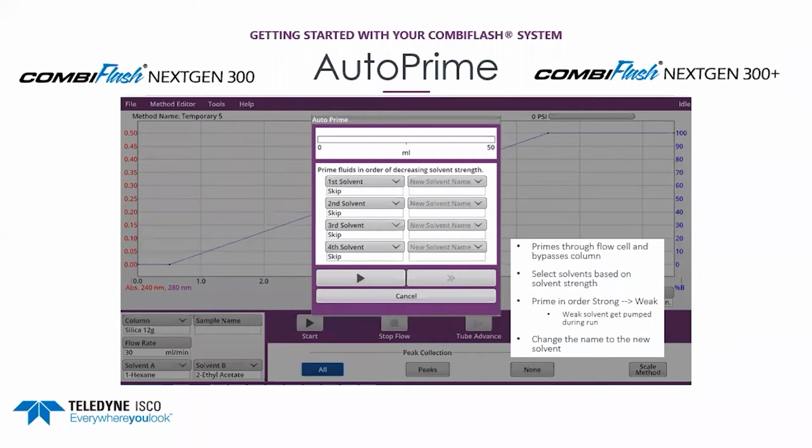For normal phase chromatography, the first solvent you would choose in the list is ethyl acetate or methanol. This is what you would choose at the top of the list as first solvent. The NextGen 100 will require a syringe to draw the liquids through the pump and effect priming. The NextGen 100 will provide priming instructions on the screen that you can follow.